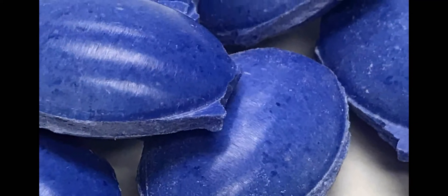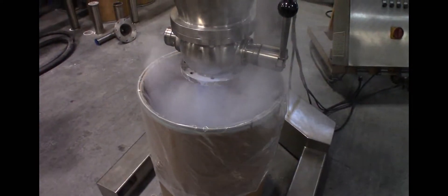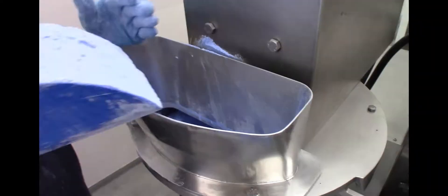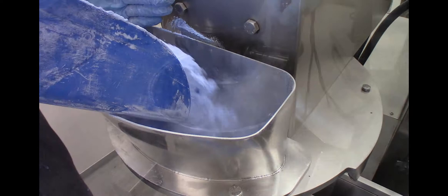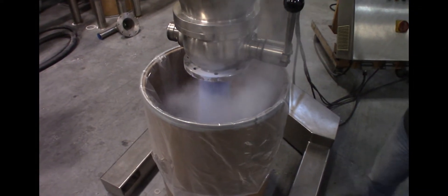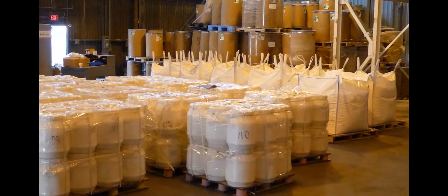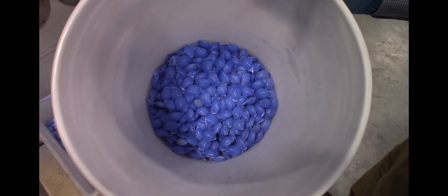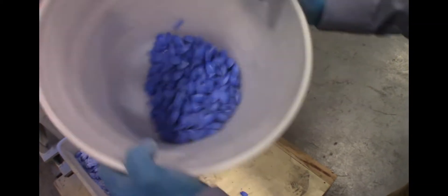Briquetting is the most economical way to eliminate dust, increase density, and improve handling characteristics of dry powders. Dust can be hazardous for operators and create dangerous working conditions. Higher weight reduces transport and storage costs, and dust-free materials have better flowing and storage properties.